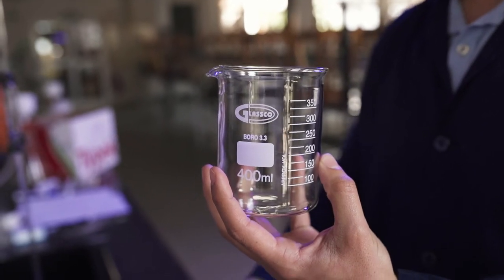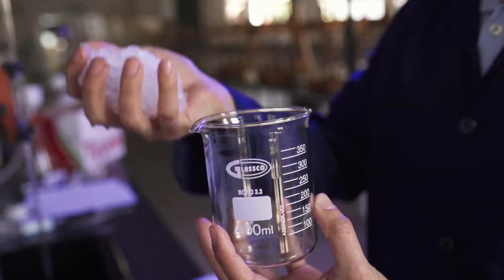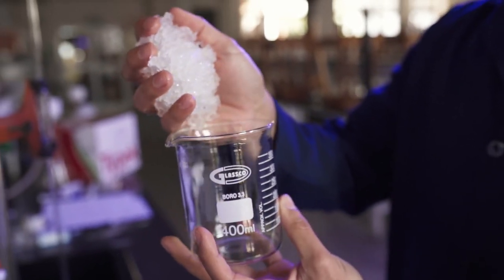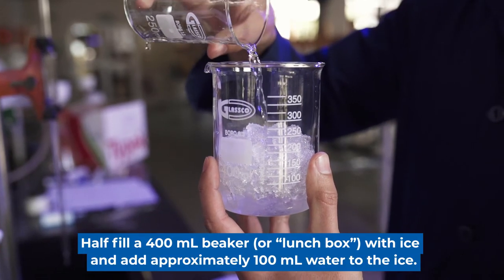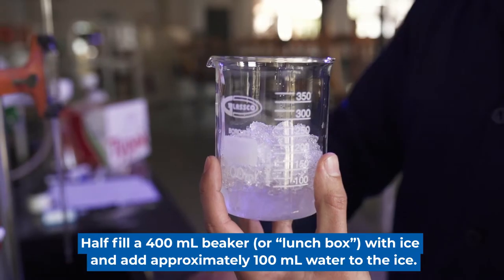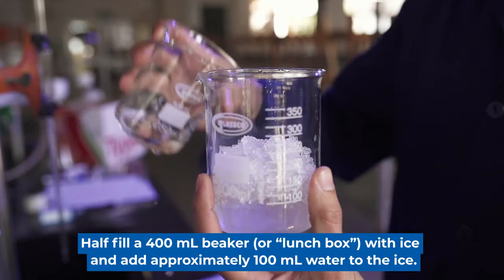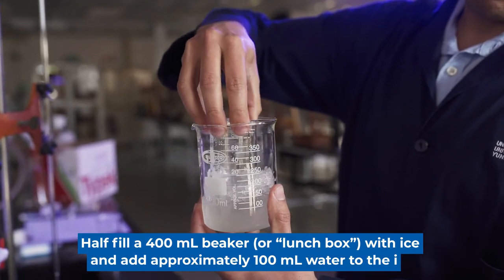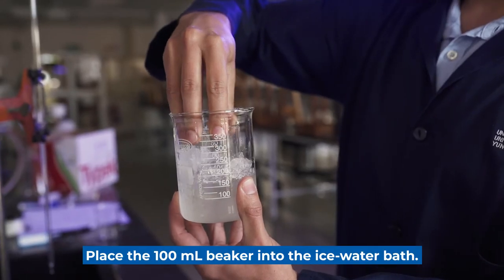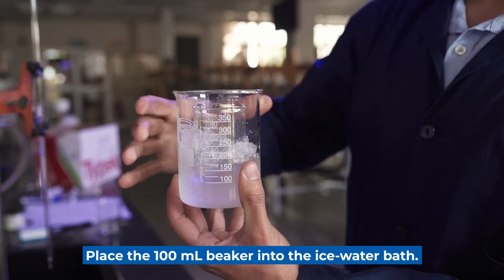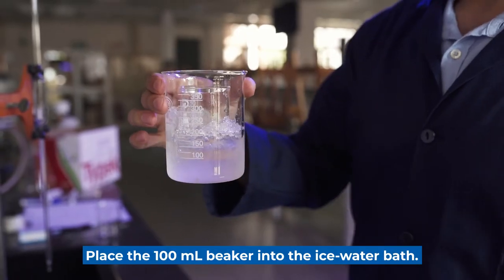Once the potassium nitrate solution is ready, we are preparing an ice bath for recrystallization. Fill the beaker halfway with ice and add water to make sure that the beaker containing the potassium nitrate solution is in contact with the ice cold water. Make sure that the meniscus of the potassium nitrate solution is beneath that of the cold water.